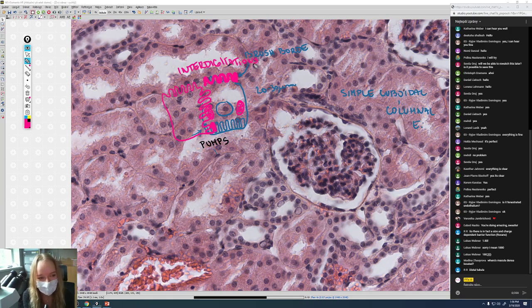Okay, so they love each other. They love each other so much. There is so much love in here. They're almost fused together, with interdigitations between these cells. So you really cannot see the borders of the cell or the lateral surfaces around the cell. It's impossible.